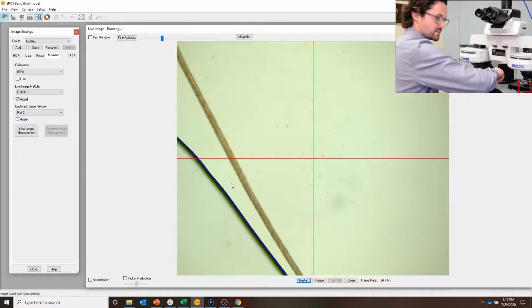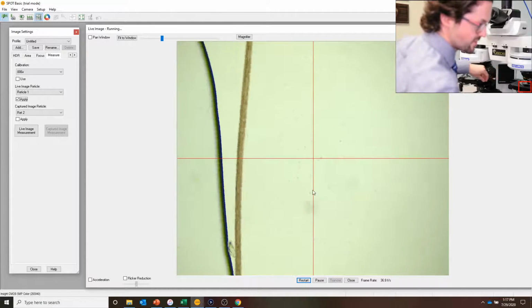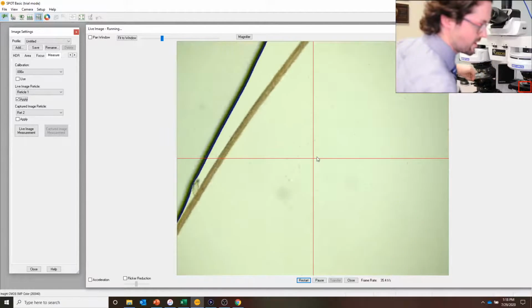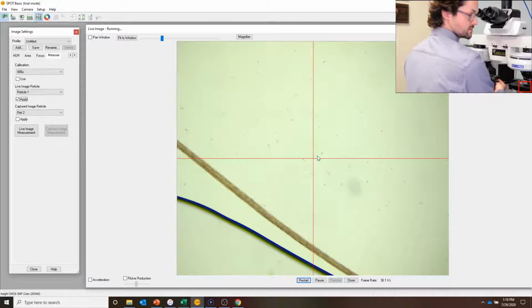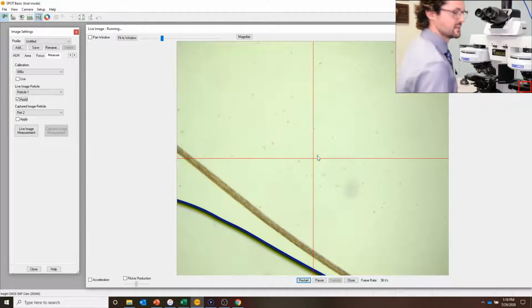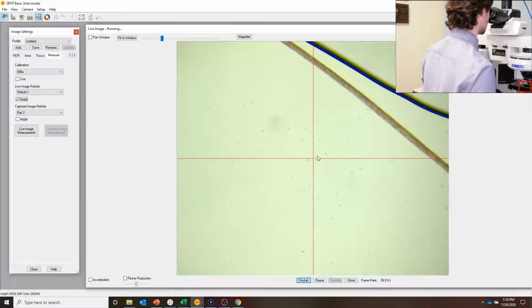As I move it around, I think we can safely say we have a circle that's coming down here, coming up, and its center is just right about here, I would argue. And so then we're going to go to our centering screws and just slightly adjust it. I could be doing this with the eyepieces, but actually this is pretty good off the monitor. Right there, and now we test it. That's definitely better just looking at that, but let's move it again.